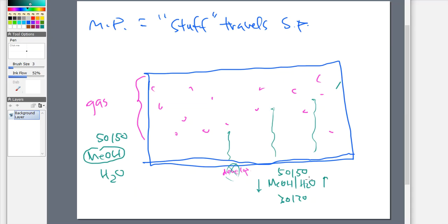Now, there is a chance that it might not be. There's a chance that nothing is volatile. There's a chance that you use the neat liquids, so it doesn't really matter. Neat liquids are neat liquids. There's no composition changes that are beginning to take place. But if it is a mixed solvent, and if you do have components that are volatile, by the time your plate gets dunked, that developing mix that you made is no longer what's in the bottom of that tank.